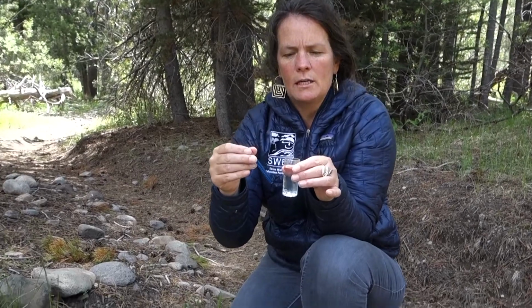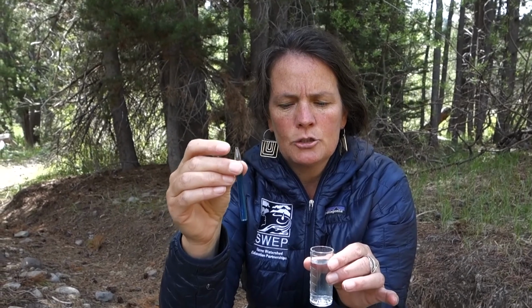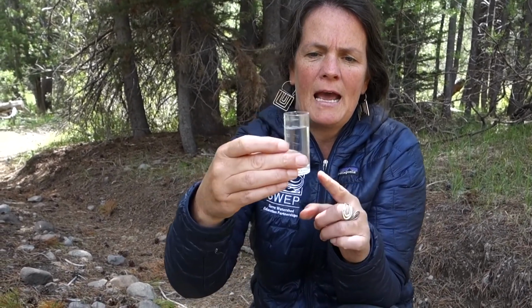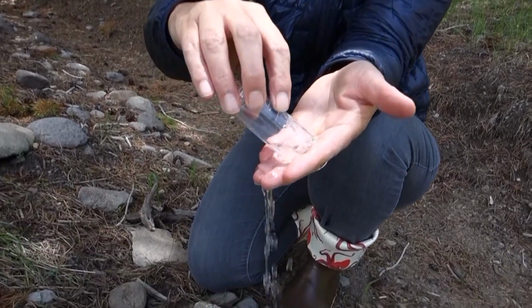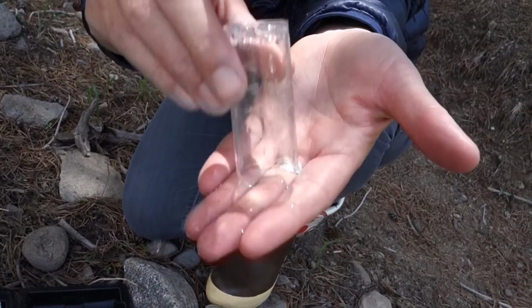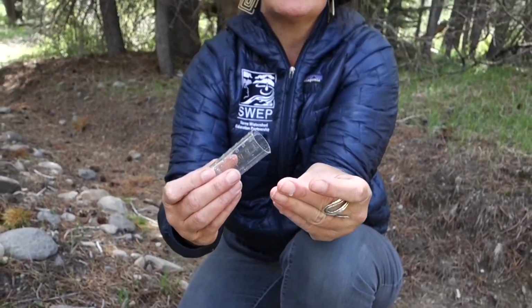Once you're done recording your data, you need to dispose of your tools safely. So the broken ampule, be careful, it is broken glass. You're gonna need to put that in a little trash baggie to take out with you. And then your sample cup has a piece of broken glass inside of it, so I'm gonna be careful. When I dump it out, I strain it through my fingers and try to tap out that broken glass and dispose of that with my broken ampule as well.